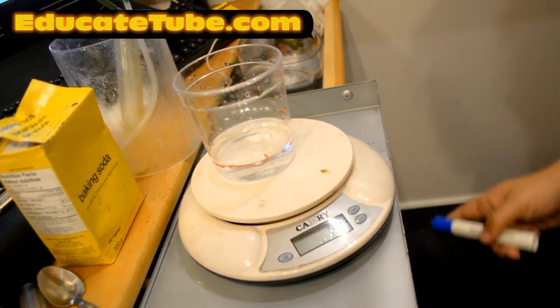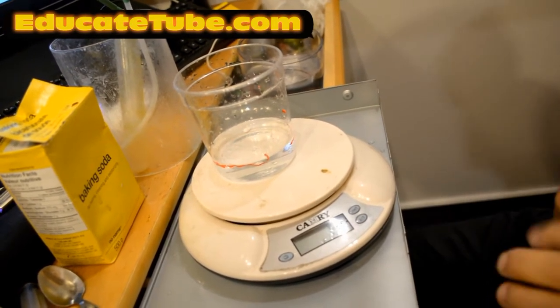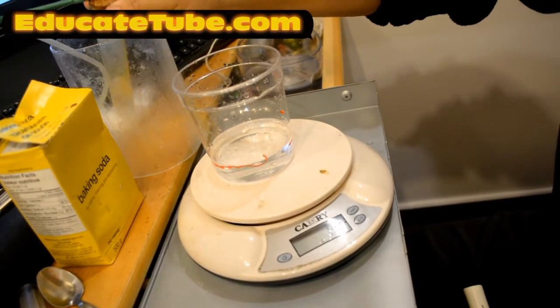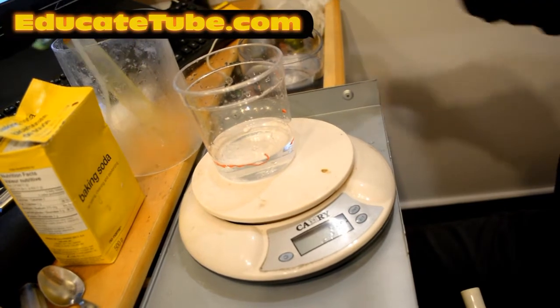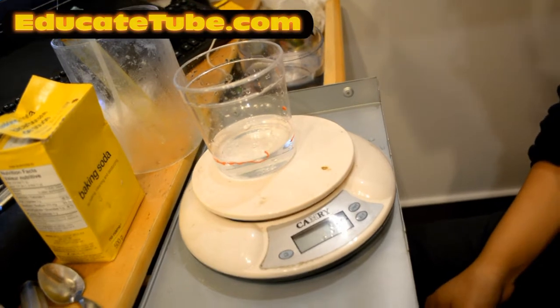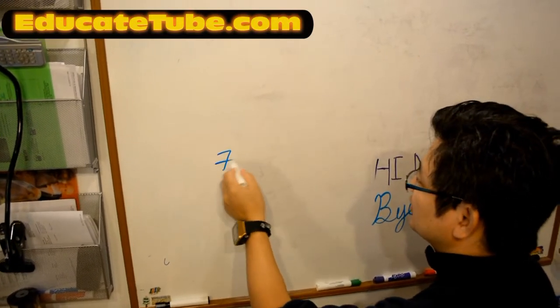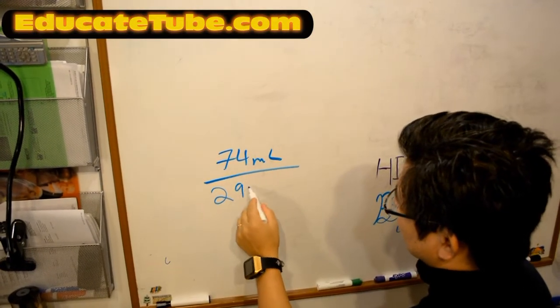Okay, if you think about it, let's have a look at the percentage error. Assuming I did everything right, which I didn't, because a lot of the gas escaped. I should have used a rubber stopper instead of this porous type of stopper. It's okay, anyway, let's calculate the percentage error. Let's look at how much error I had. 74 mL of gas was produced. Theoretically, I should have 290.